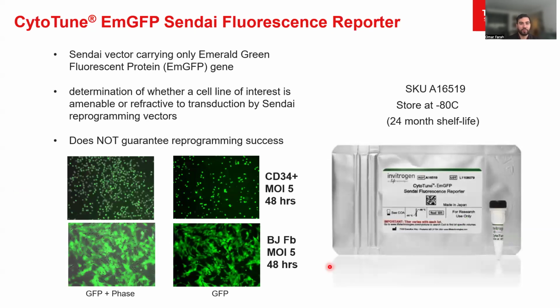Now, I kind of just threw this at you and I said, well, the recommended MOI is 5 for the KOS vector, right? But what if we did not know that? We know that because we've done a lot of background work. But what if you're working with a newer cell type, right? Not fibroblasts, or a really particularly hard to transfect cell. Well, there are some other tools that can help you figure this out.